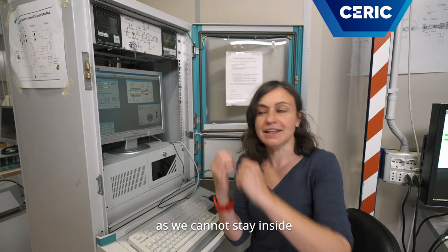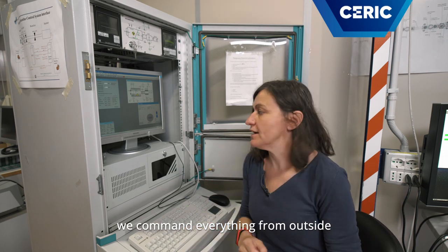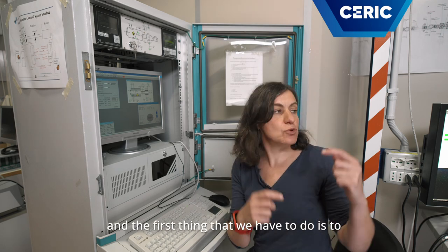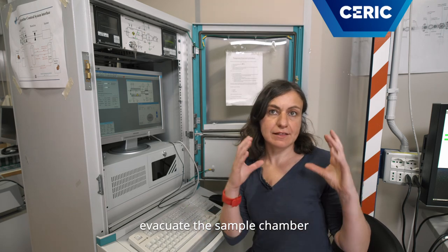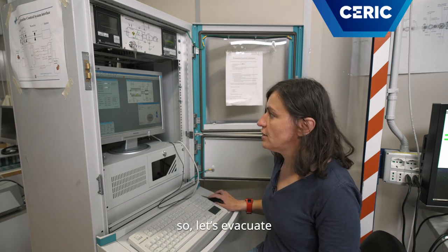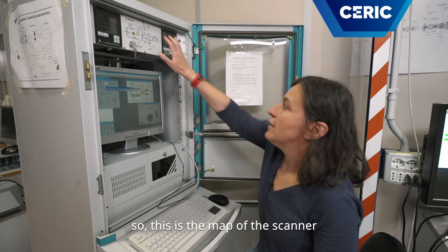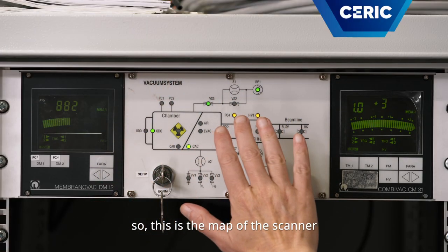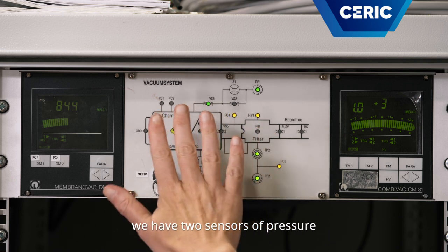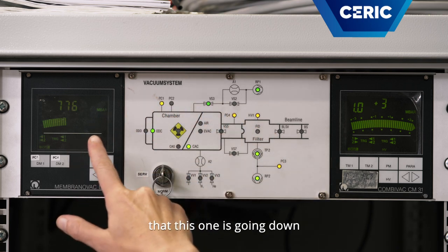As we cannot stay inside while there are X-rays, we command everything from outside. The first thing we have to do is evacuate the sample chamber in order to have everything green. So let's evacuate. This is the map of the scanner. We have two sensors of temperature. We can already see that this one is going down.